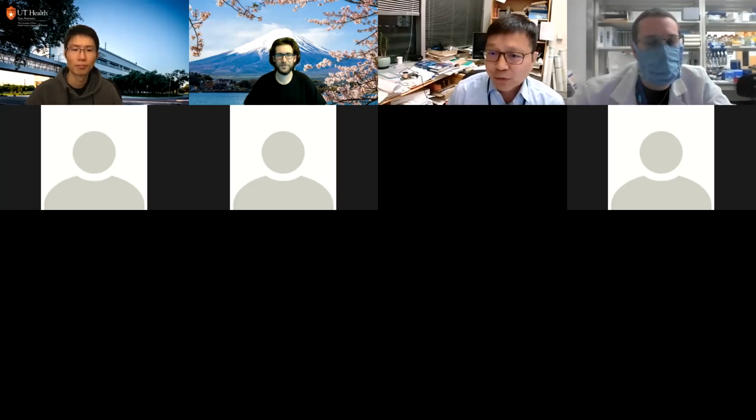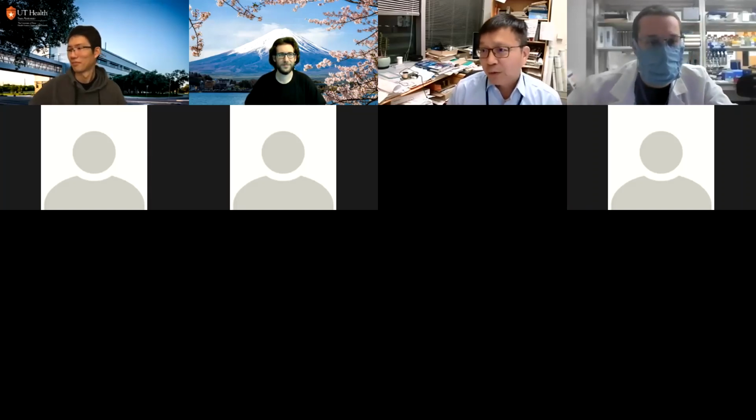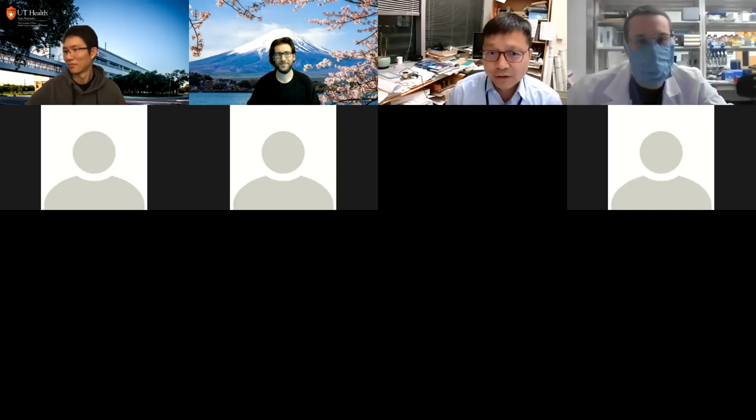There is actually something pretty interesting. If you want to follow the internet thread, there is a lot of controversy between read counts, FPKM, TPM, CPM, and all these things. But it's kind of a fun read if you want to.